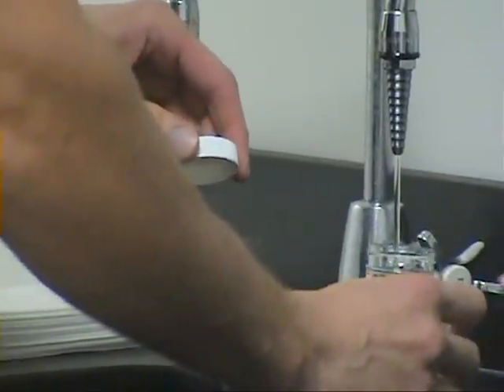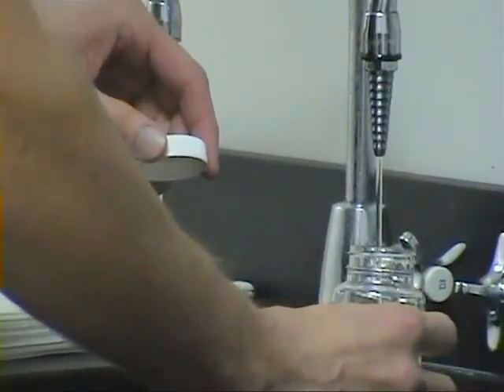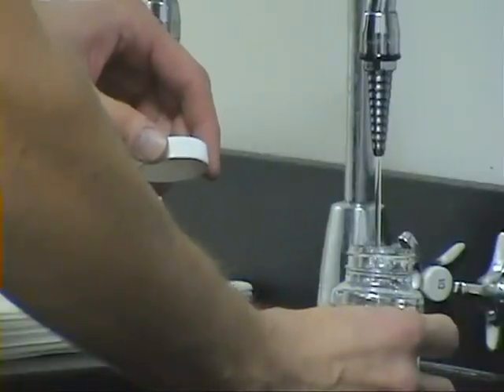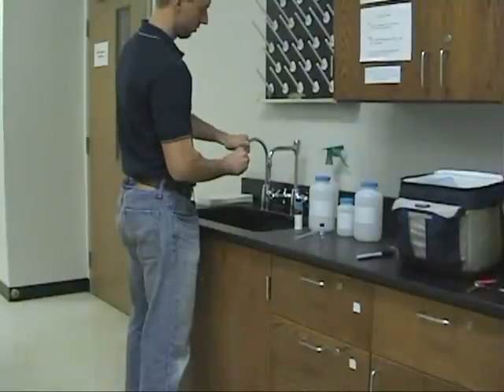Collect the sample in the sterile bottle provided by the laboratory, at least to the fill line, but do not overflow. Immediately cap the bottle and prepare for transport to the laboratory.